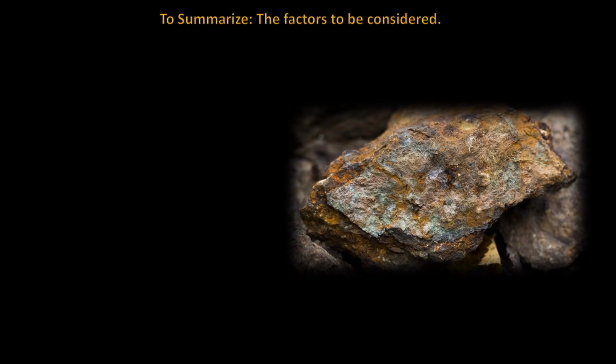In order to summarize, that is, to put things into perspective, for dissolving sample material, the nature of the sample must be understood. Does the sample contain copper or more than one element of interest? Is the matrix of the sample a silicate such as quartz? How will the reaction with acids react on the sample matrix and the analyte? Most of the time you will want to fully decompose your sample material into a solution.